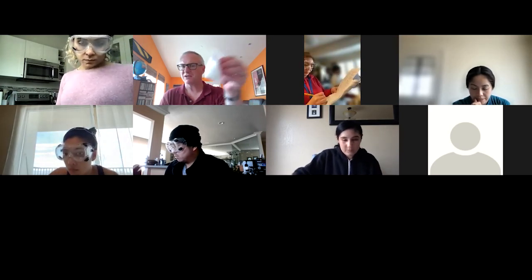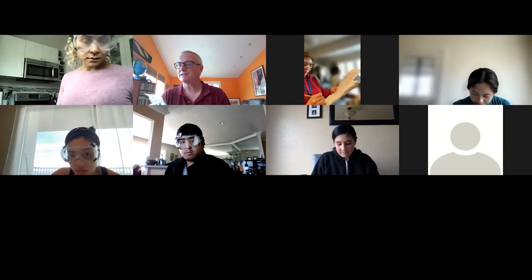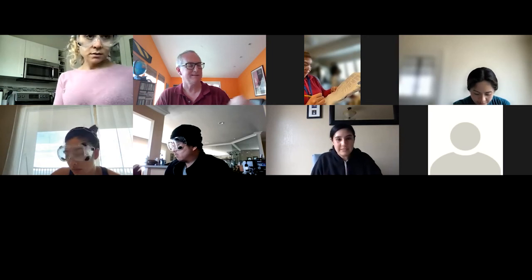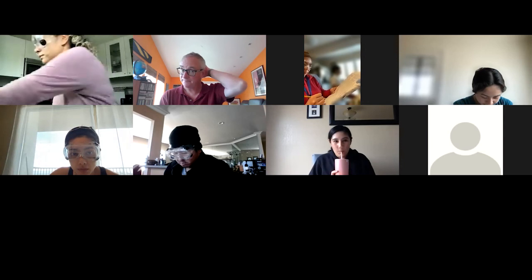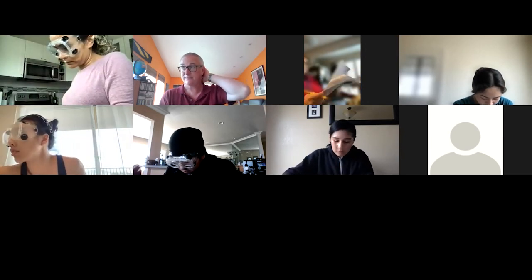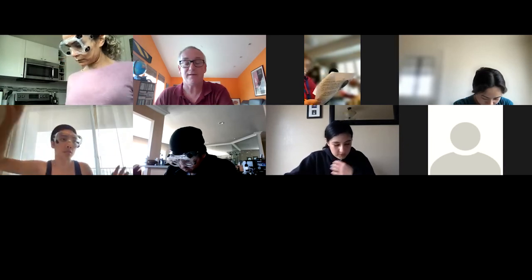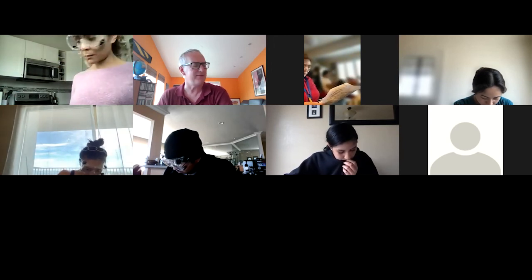Let me double check and make sure this actually is a heptahydrate. Yeah, it says it's hepta. We're in trouble. But hey, 6 divided by 7, that's only about, is that a 14% error? That's not too bad. Basically anything less than 25, I consider a victory.